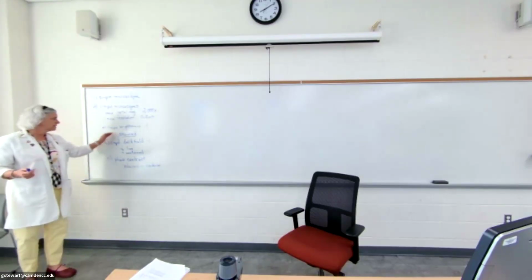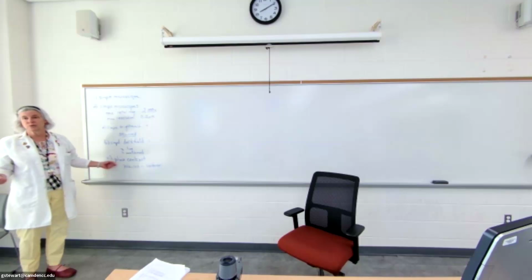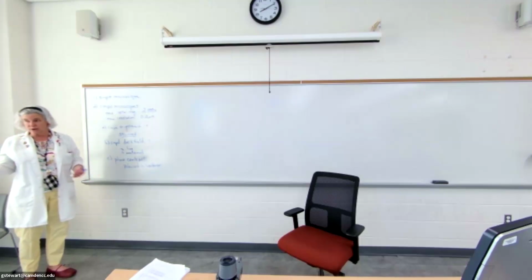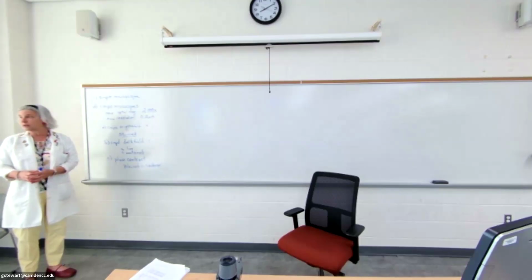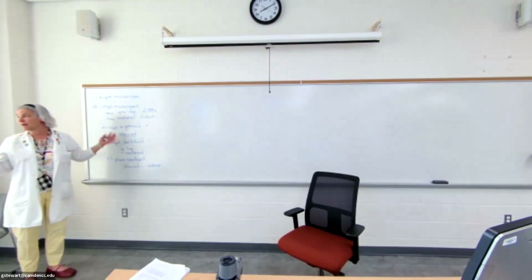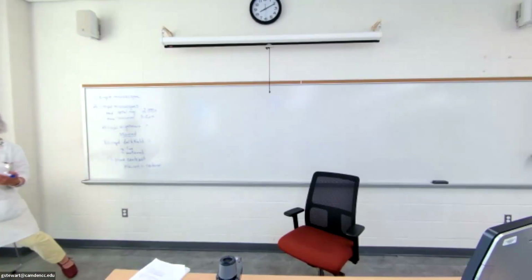This microscope is like a combination of these two. And if you switch out the light source, remember the last one I had on here was fluorescent microscopy. You can purchase one where you can change out the bottom component and take out the white light bulb and put in a UV light bulb. And now you have like all 4 microscopes in one microscope. Awesome. Except it's going to cost you about 4 times the amount of that microscope, right?